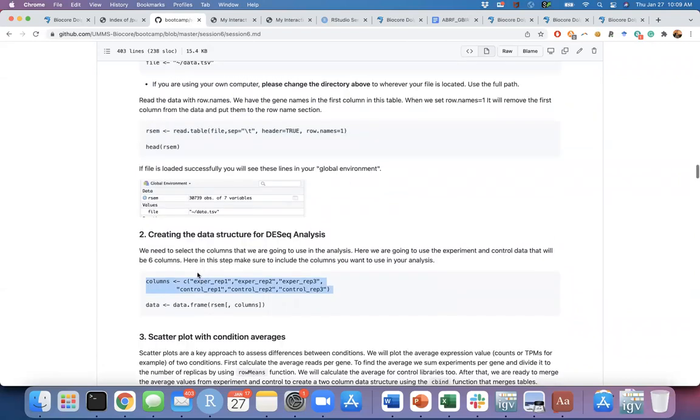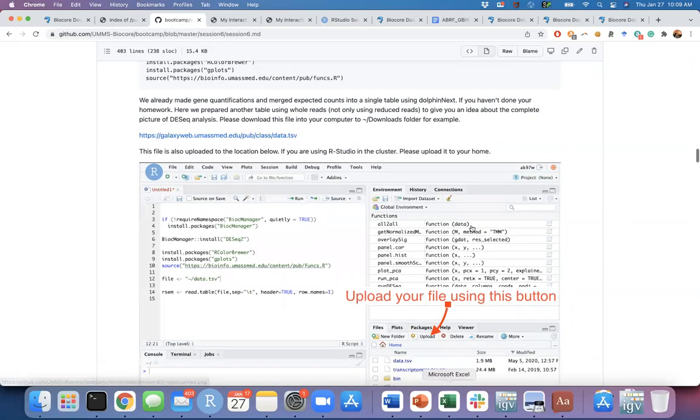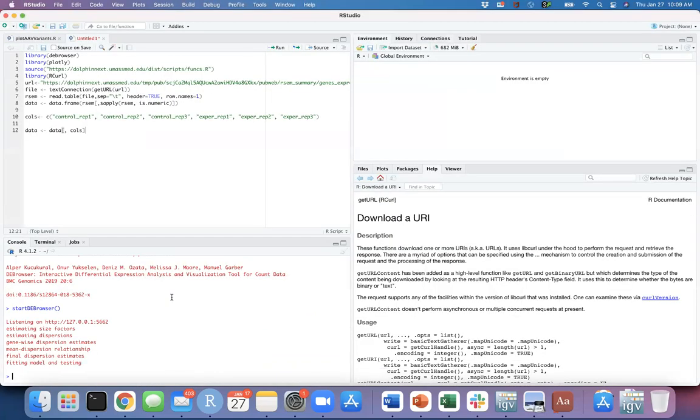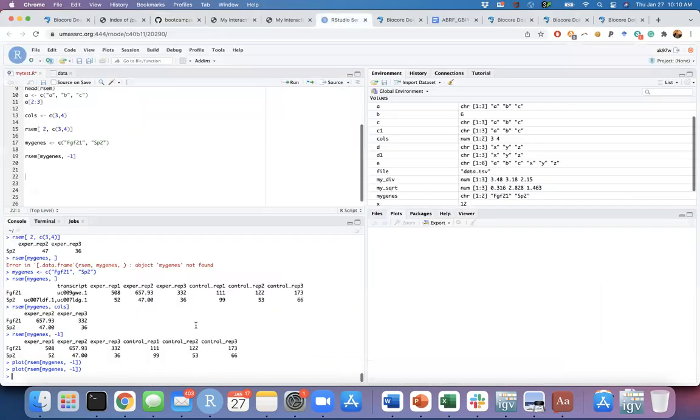By the way, before I actually start doing this, I want to go back, and this is just an initial introduction, I think, for how you start using it. And I'll give a 10 minute break, because this might take time for some of you if you haven't installed these things. But I want you to install especially these plots, gplots and DESeq2. You copy these lines and install into your environments. It can take some time for some people.